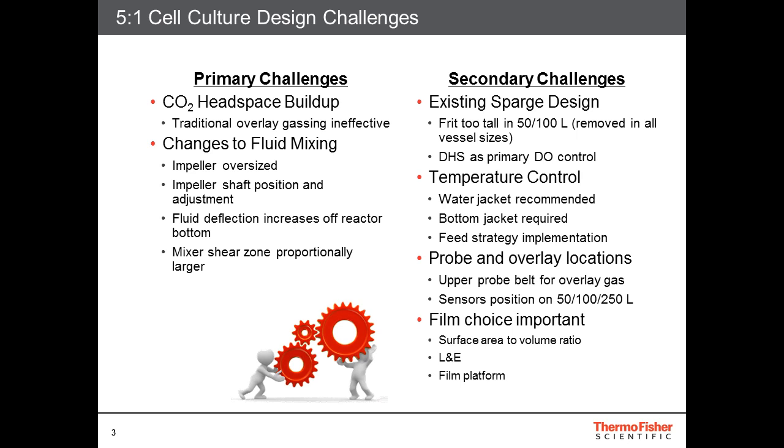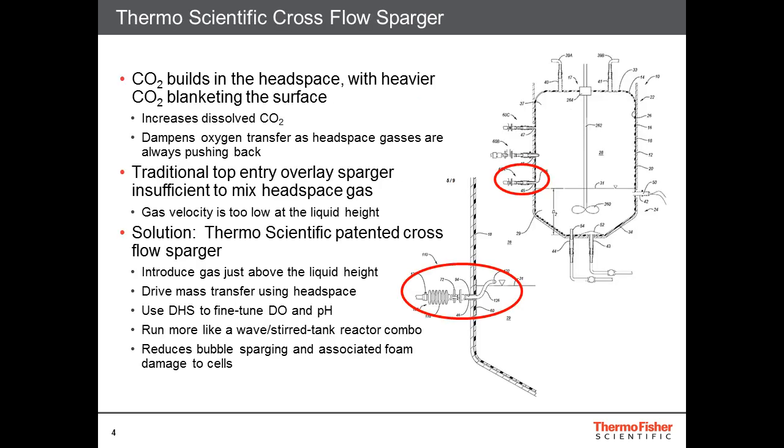So let me show you a diagram here. When you look at this diagram, typically the overlay is on the top. When you provide the overlay from the top, it will not be able to flush out all the gases built up in the headspace.